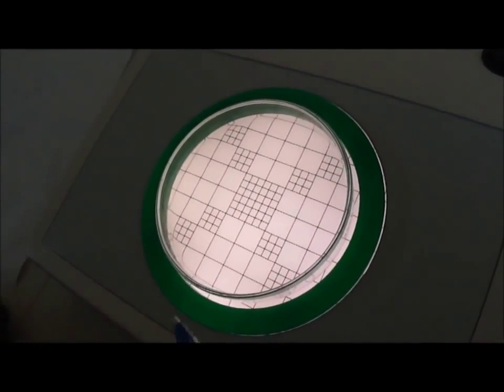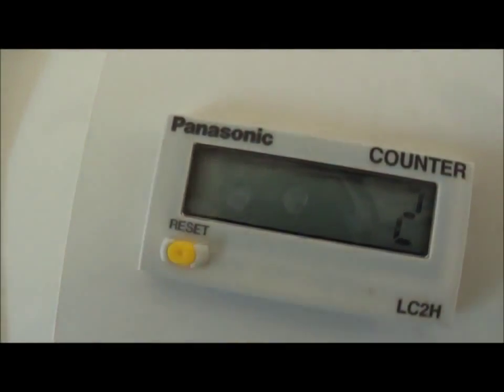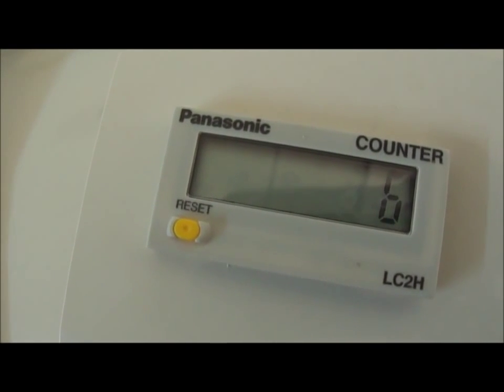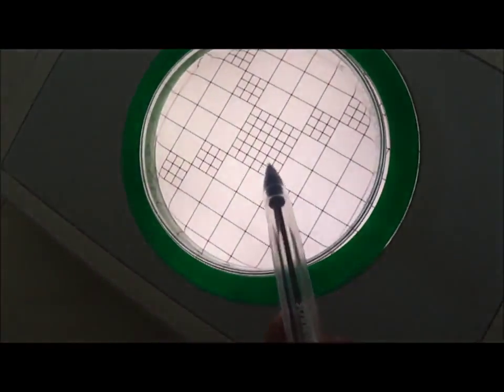Now, if the device is on, you just press on each colony, and the counter shows the number of groups or colonies you have. If you have 1 here, you press, and then you look, the counter is marking 1. If I press again, 2, and then 3, and you count this way, it will record directly the number of colonies you are counting. Now the frames inside here make it easier to distinguish the boundaries of your groups, the bacteria colonies, as you see here.